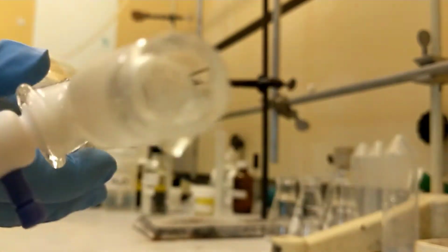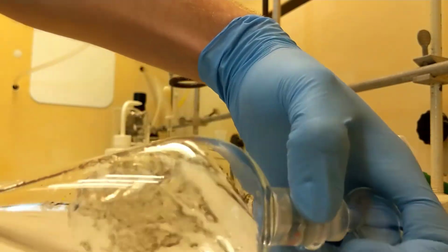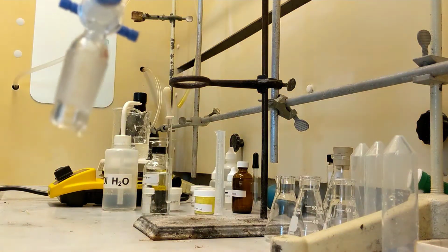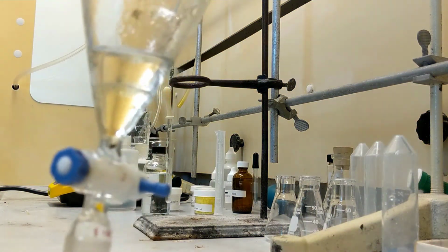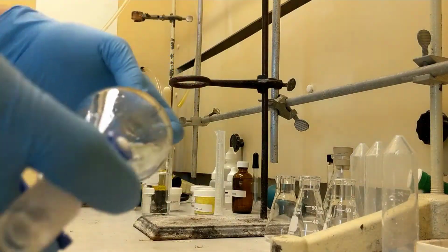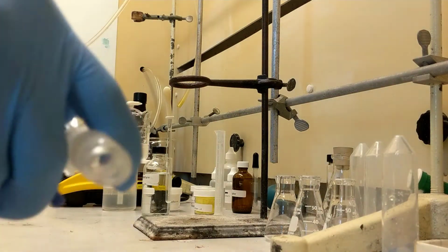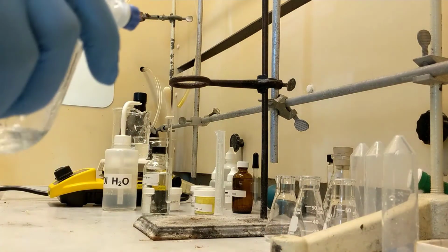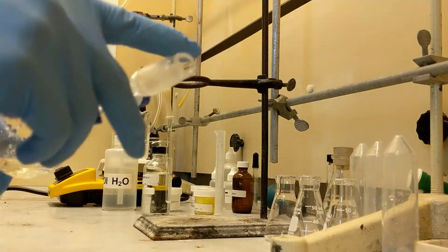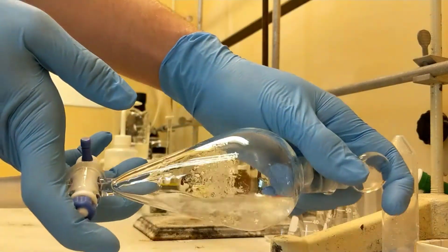So I'm gonna rock it back and forth. Let's see if I can get you guys a better image. There we go. I'm gonna rock it back and forth, trying to get those two to line up. And now, see, I shake, and you see no emulsion has formed, right? Two clear layers. I'm just gonna keep shaking for about a minute, okay? Shake, shake, shake. I'm gonna check the pressure. Yeah, there we go. Shake, shake, shake. Make sure you guys can see.